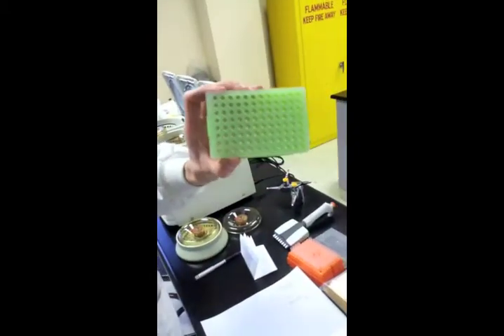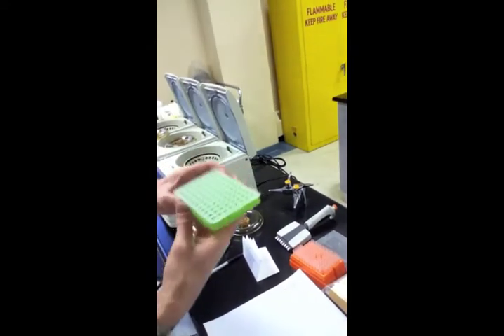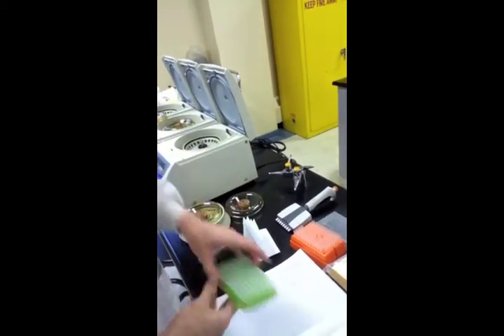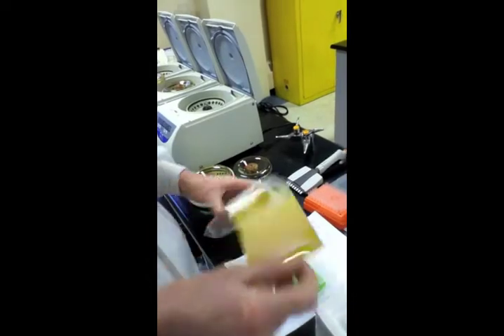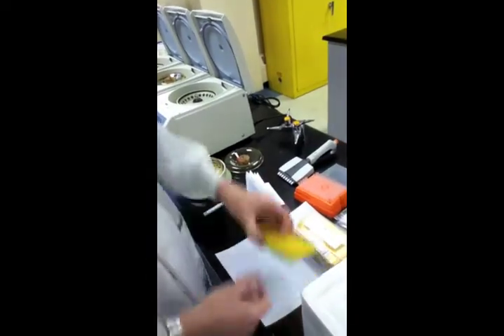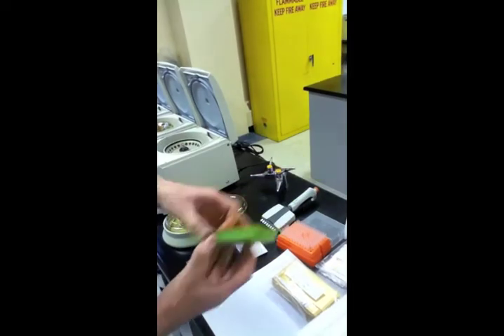We're going to run these PCR reactions on a 96-well plate, and so each of your individual samples will be loaded in one of these wells. And once these wells are loaded, we have this fancy sealing film, and we're going to seal these reactions so they're absolutely airtight with this fancy adhesive film.